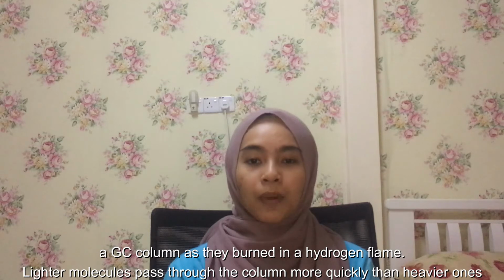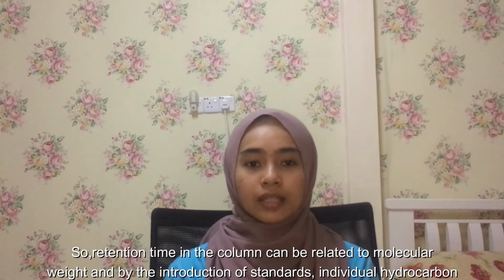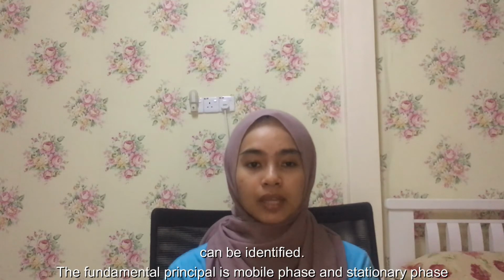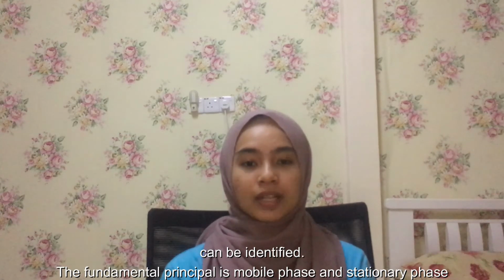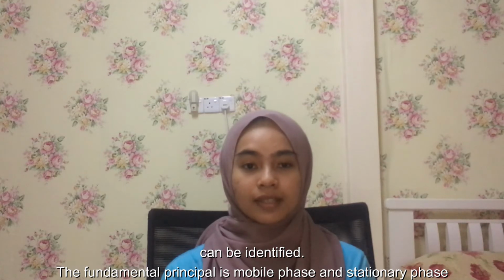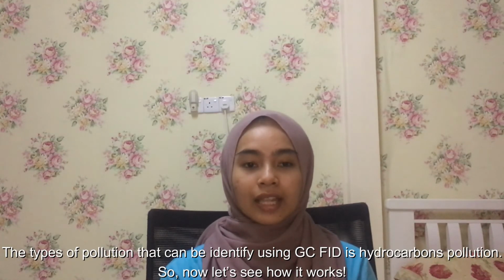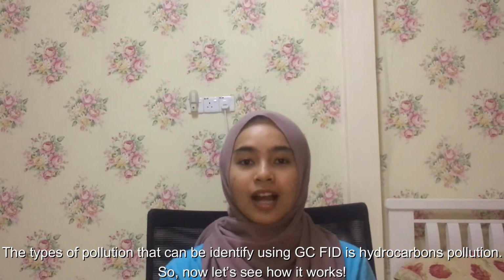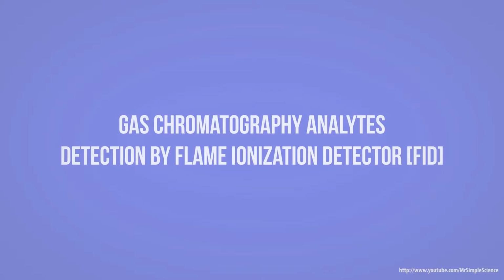Lighter molecules pass through the column more quickly than heavier ones, so retention time in the column can be related to molecular weight, and by the introduction of standard, individual hydrocarbons can be identified. The fundamental principle is the mobile phase and also the stationary phase. The type of pollution that can be identified using GC-FID is hydrocarbon pollution. So now, let's see how it works.